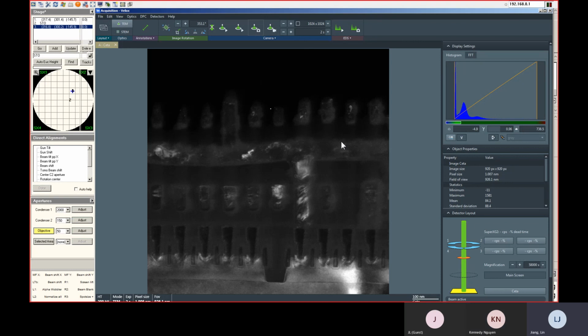Okay. You went through in order: bright field, dark field, and also alignment. I guess this afternoon we're going to take a look at high resolution imaging. We're going to look at two materials, silicon and STO. They both have very strong diffraction. Also I'm going to tell you a little bit, because if you do high resolution imaging, we have to tilt the sample to the zone axis. I'm going to show you some tricks on how to use the Kikuchi pattern to tilt the sample to the zone axis.